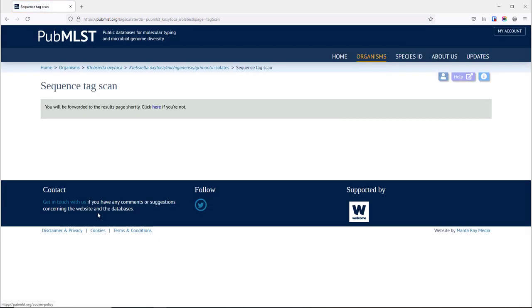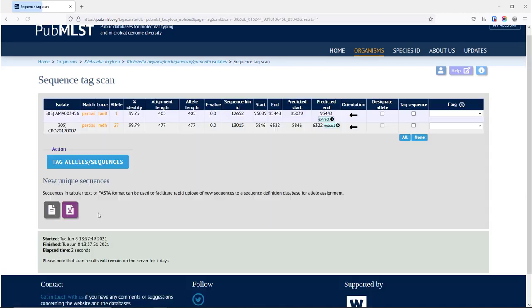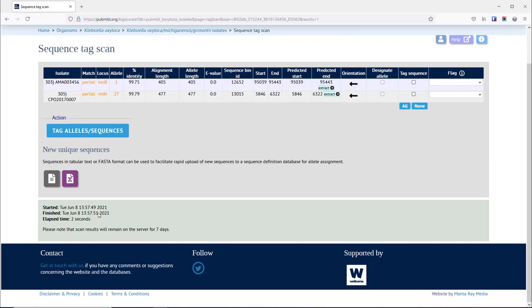It will then take a couple of seconds and hopefully we'll identify some new alleles. In this case it's found two new alleles. These are close matches to existing alleles, so you see there's 99 percent, 99.75 percent identical to an existing allele. These can be assigned.